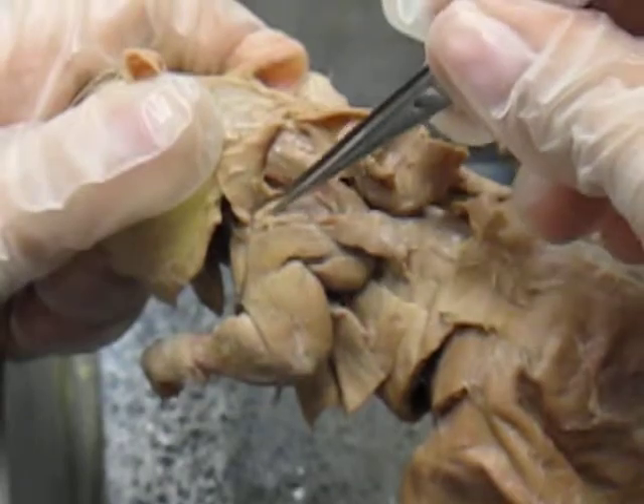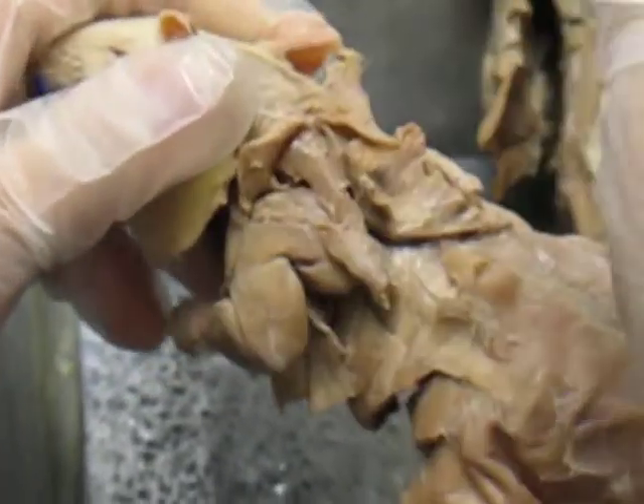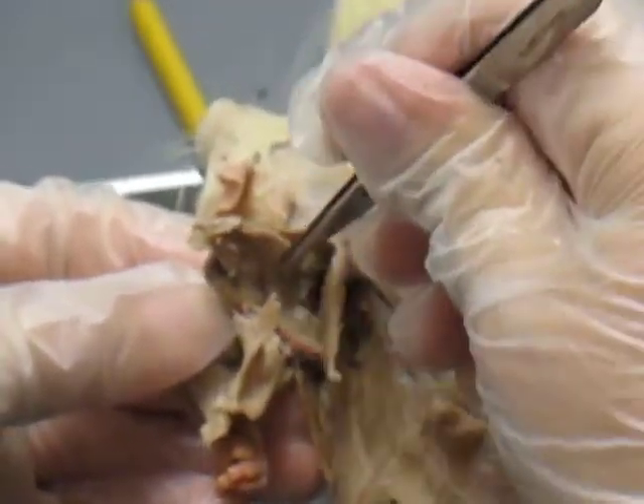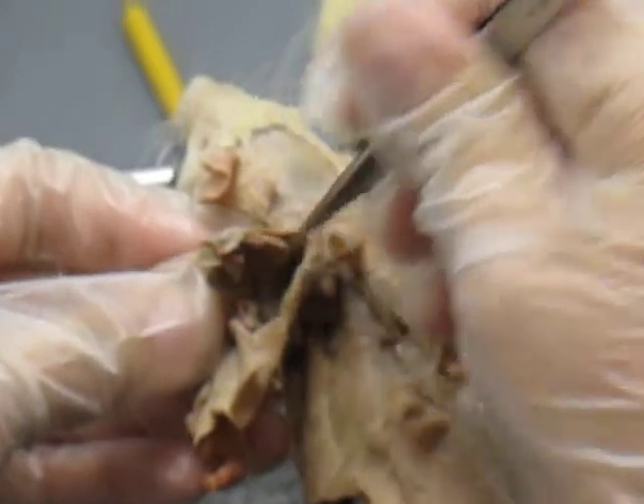You have your supraspinatus, which is on this side, as well as when you flip it over, it's on this side as well. So it kind of goes around both sides.